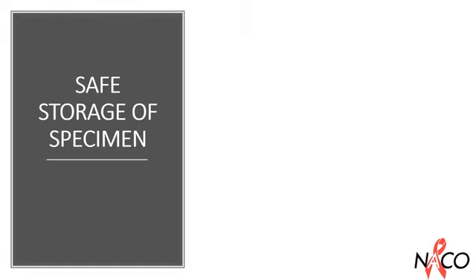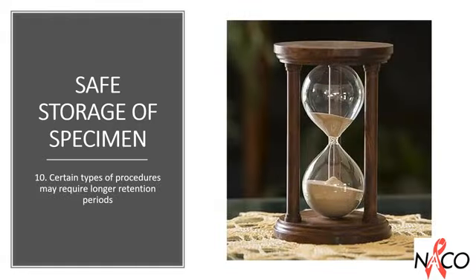There are certain samples which have legal concerns regarding the type of procedure. For example, histopathology examinations may warrant longer periods of sample retention. This has to be taken care of by the laboratory.